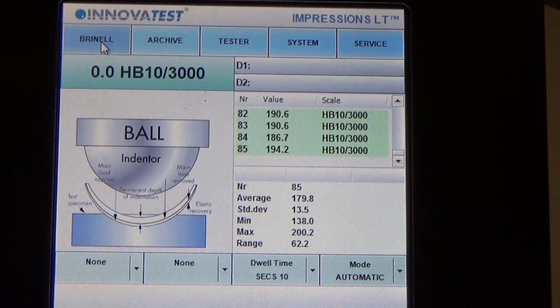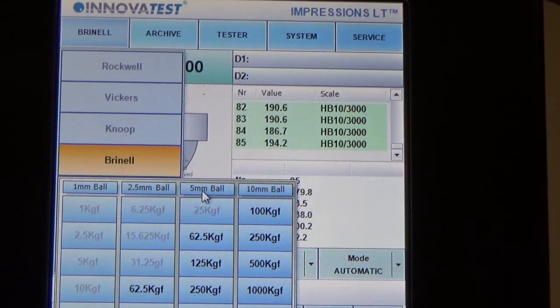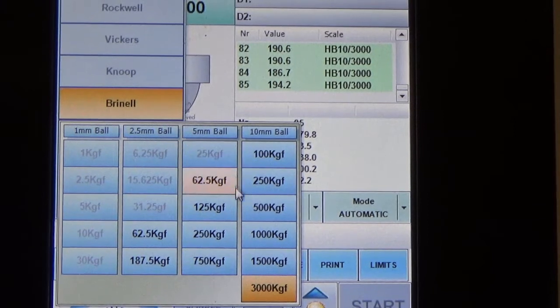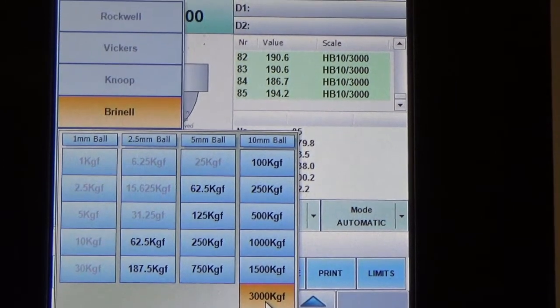The first step — you can see the Brinell tab whereby you can choose different diameters of indenter depending on your configuration, as well as different force levels. For this instance, we will be choosing a 10 mm ball with 3,000 kilogram of force.